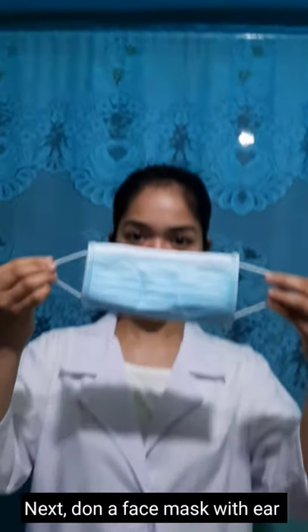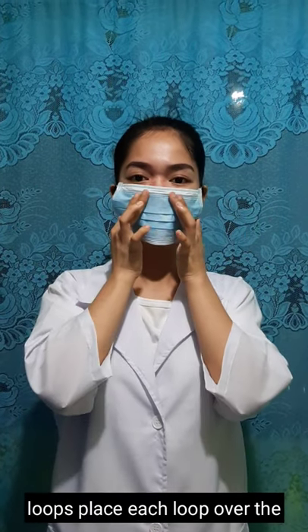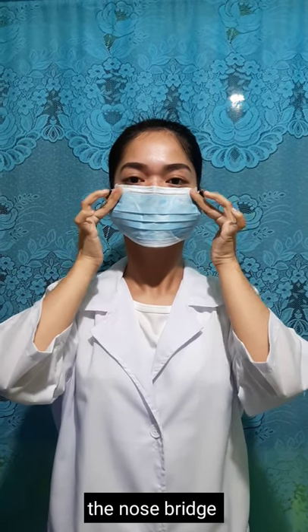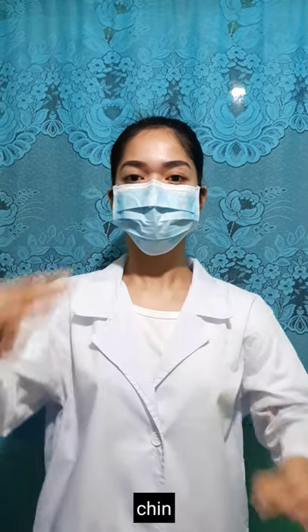That's the proper way of wearing the gown. Next, don a face mask with ear loops. Place each loop over the ear, then fit the flexible band to the nose bridge, and snug the mask over the face and below the chin.